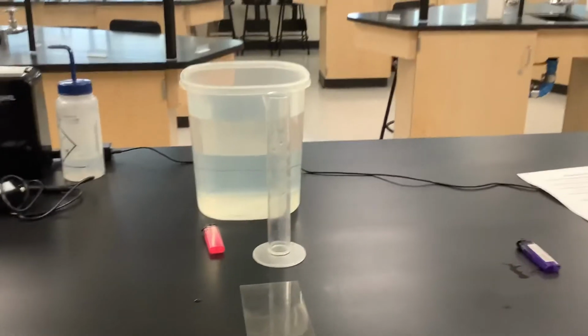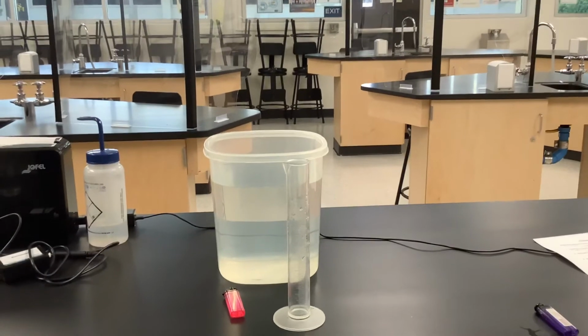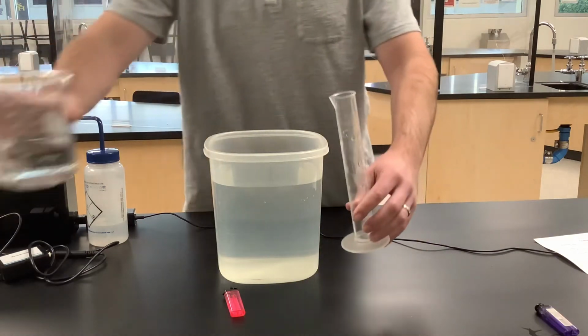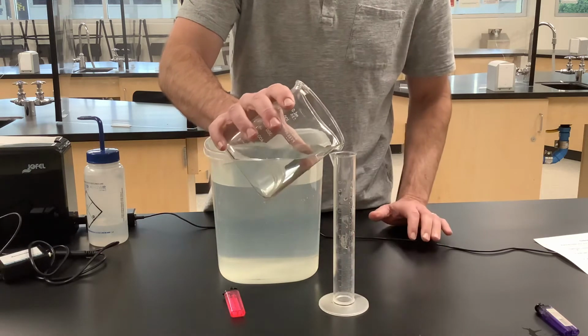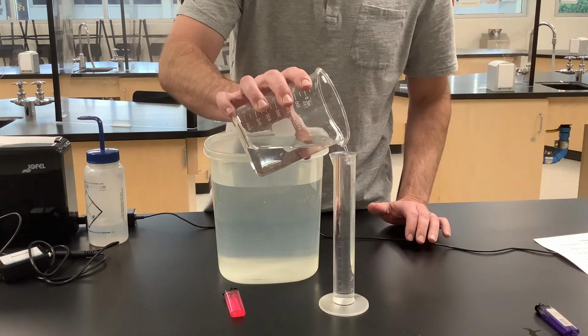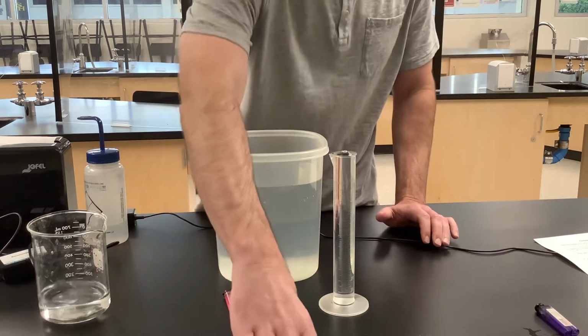In order to do this, I think I'm going to step around to the other side of the camera here, and so we can kind of see how this works. What we want to do is take our water and fill up the graduated cylinder so that there's no air in it. We're going to try and fill it right to the very brim. I might spill a little bit and that's okay. I'm just letting a few of these air bubbles get out of here.